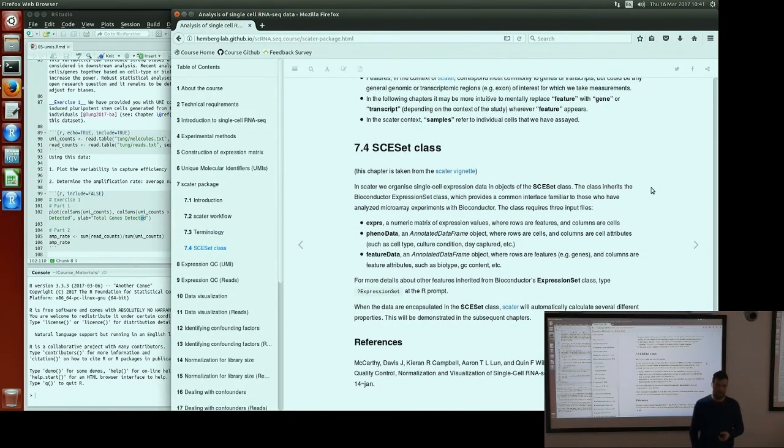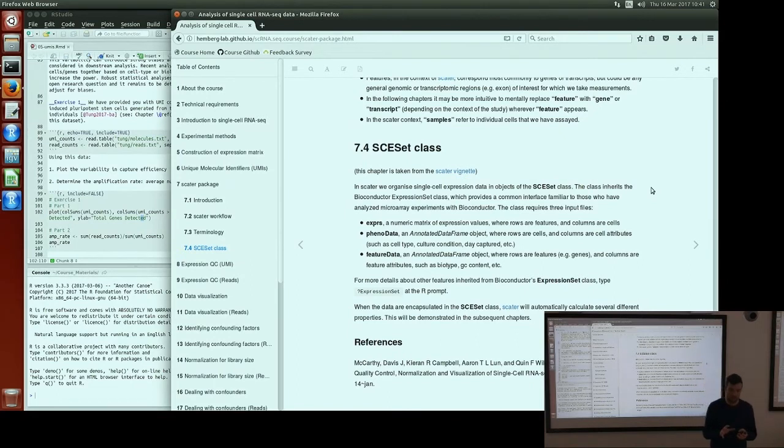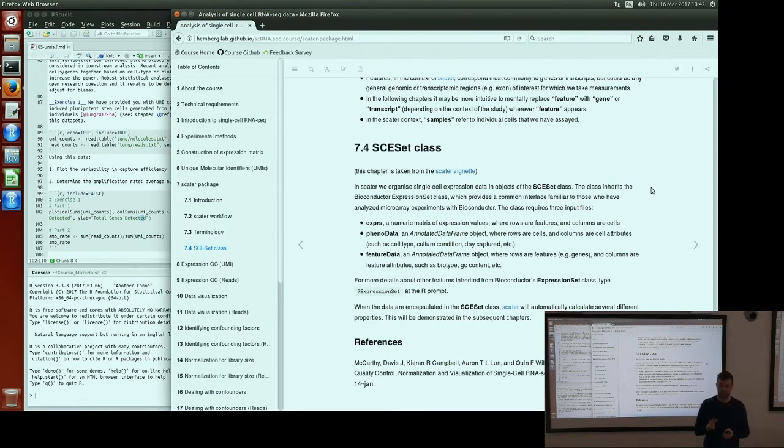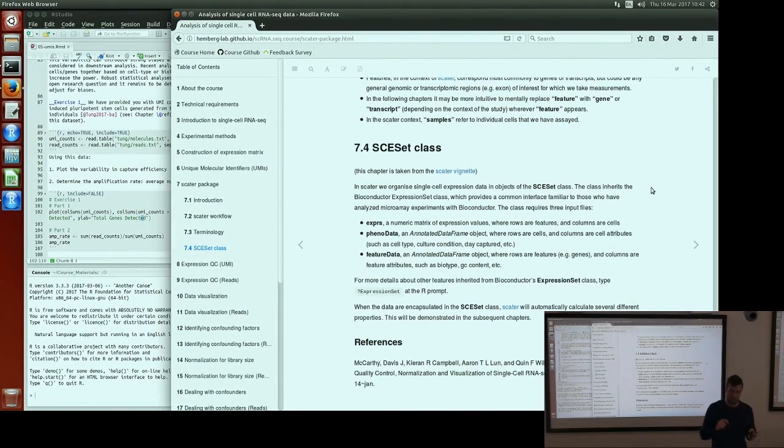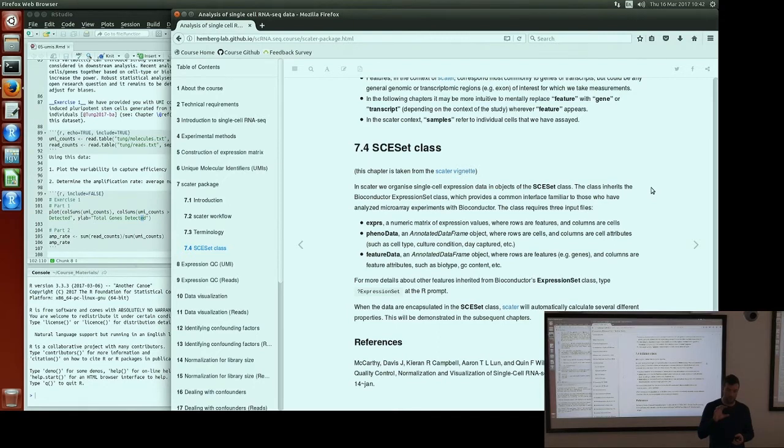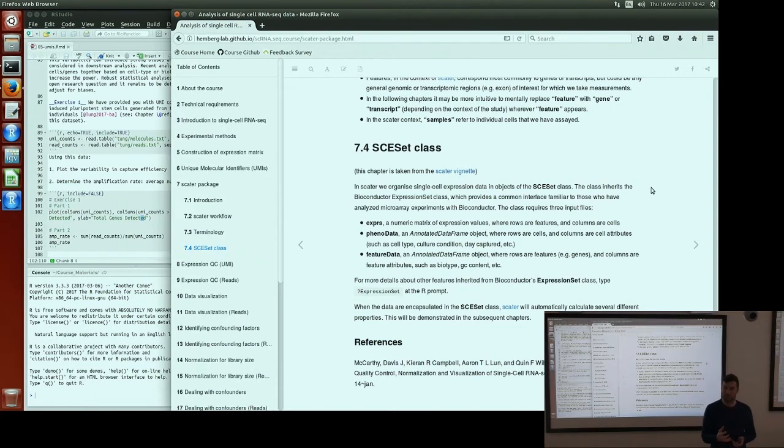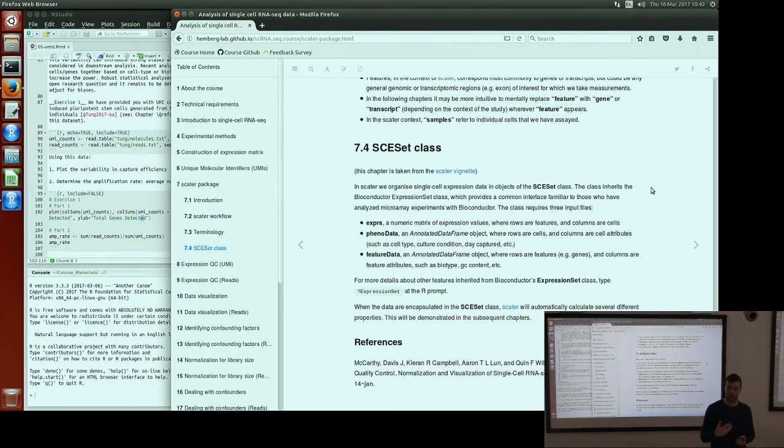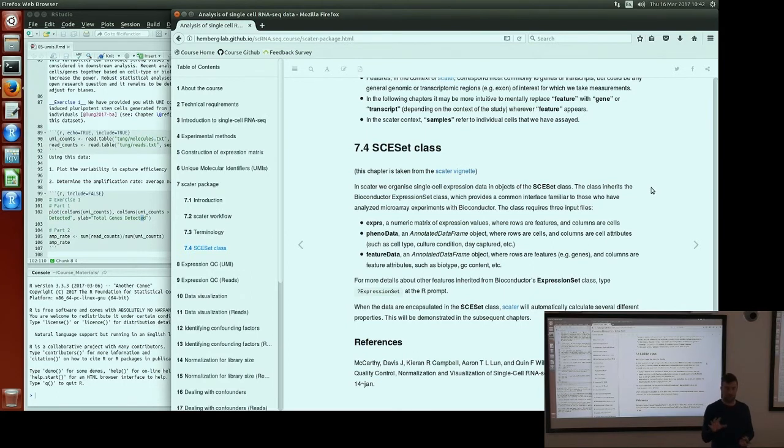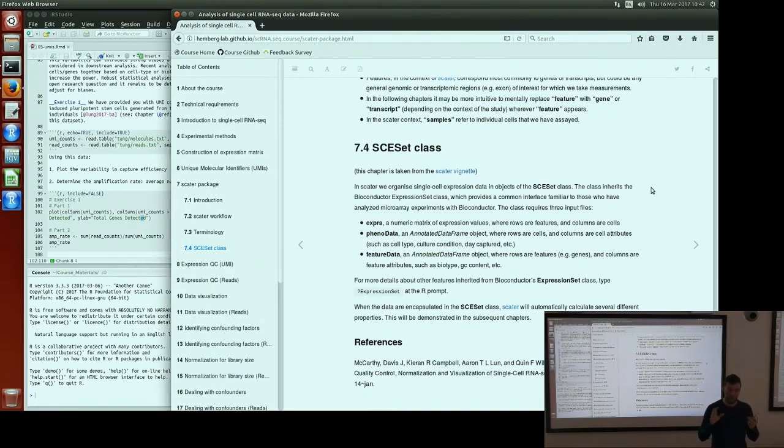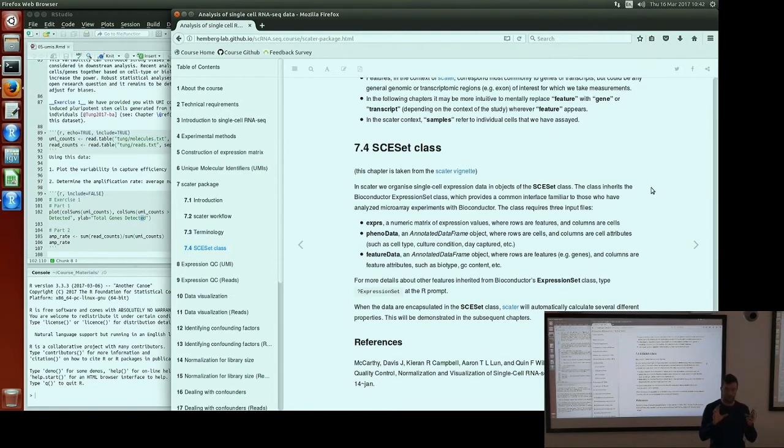When we're building up the SCESet class, it has three things that have to be in an SCESet object. One is an expression matrix—rows represent genes, columns represent cells, and the entries are the expression values for the cell and gene combination. Typically this should be on the log scale so we can use visualization and clustering methods which typically assume some Gaussian behavior. If we start with counts or molecule counts, we'll want to put them on a log scale so they look more normal, even accounting for the dropouts and increased zeros in single cell data.